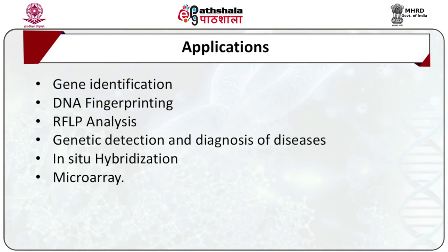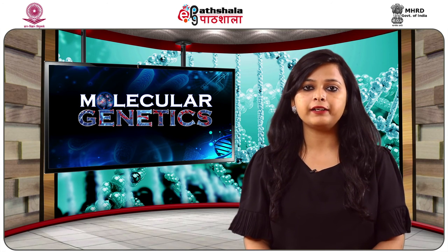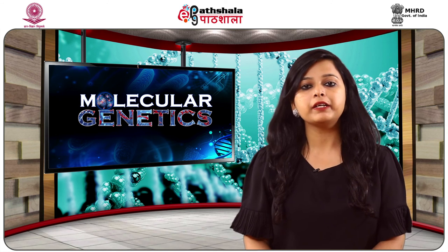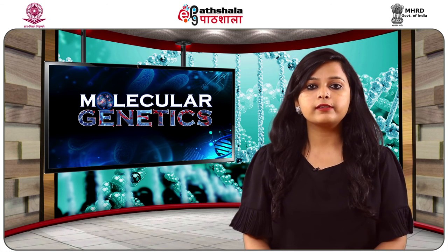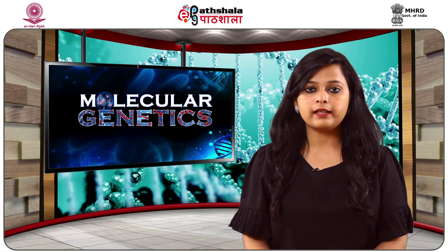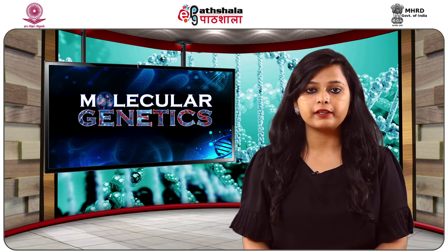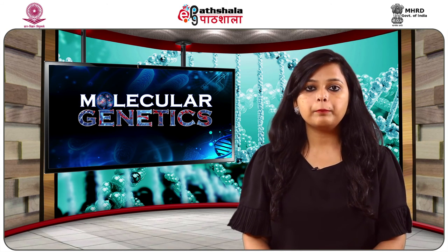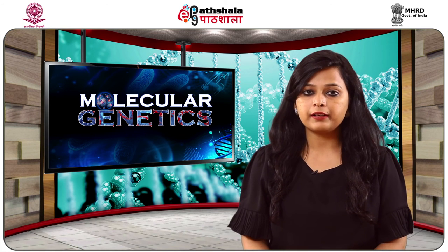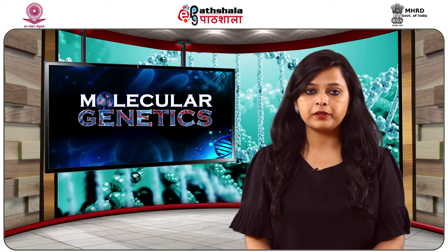Let's talk about applications of Southern blotting hybridization. First could be genetic detection and diagnosis of diseases. By means of Southern blot hybridization using gene probes, single gene disorders, for example alpha and beta thalassemia and sickle cell anemia, can be detected for prenatal diagnosis. However, currently PCR and real-time PCR techniques are the preferred choices as they are fast and less laborious methods.